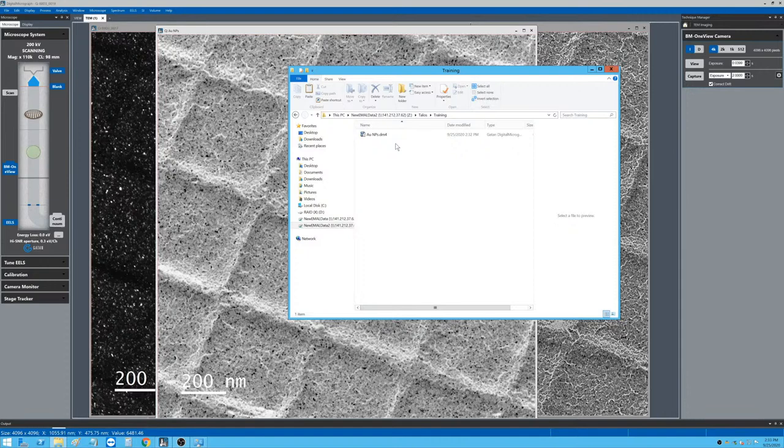Of course, you can also use a USB drive. You can borrow the USB sticks from our front desk and transfer the data over from these computers to our public data analysis computers. And then from those computers, you can transfer the data to your own USB or your own cloud drive, things like that.